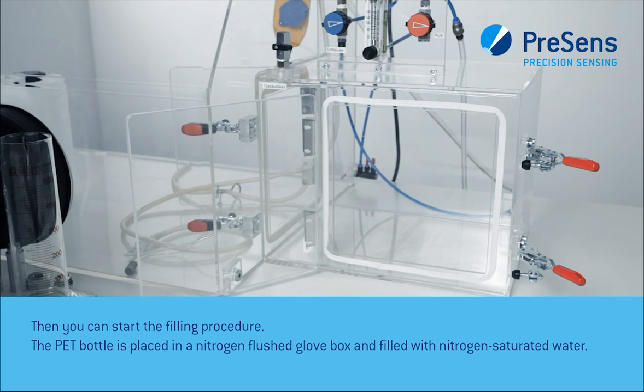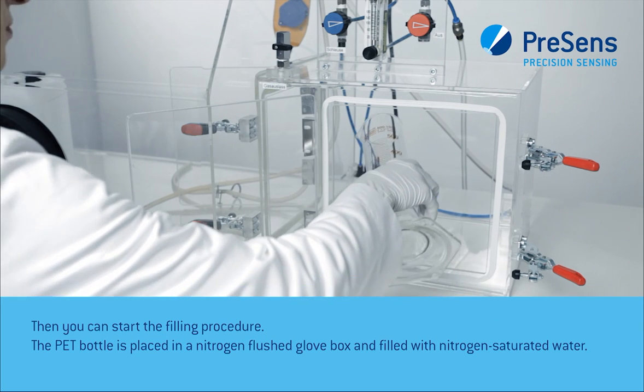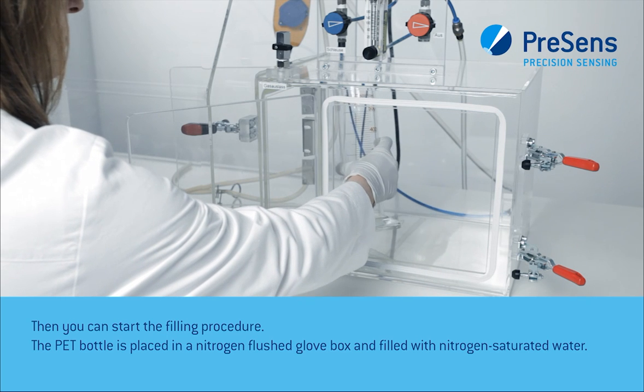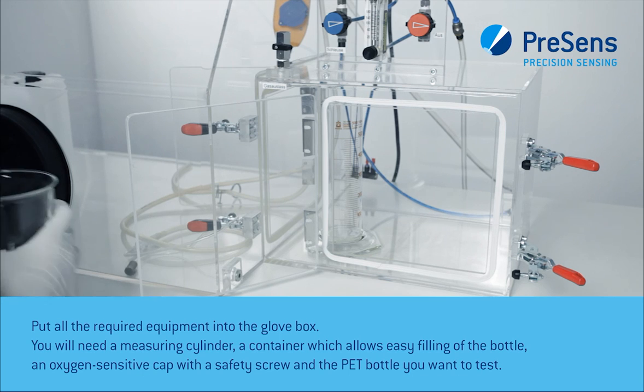Then you can start the filling procedure. The PET bottle is placed in a nitrogen-flushed glove box and filled with nitrogen-saturated water. Put all the required equipment into the glove box.